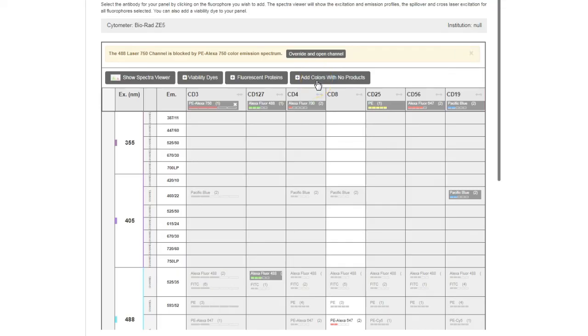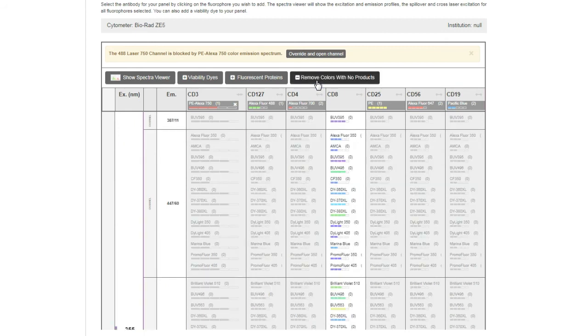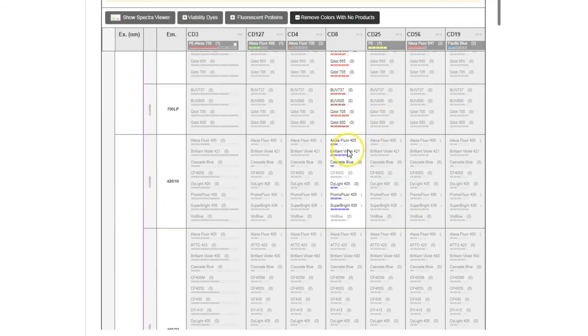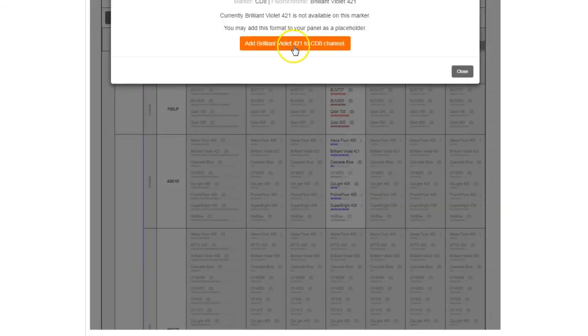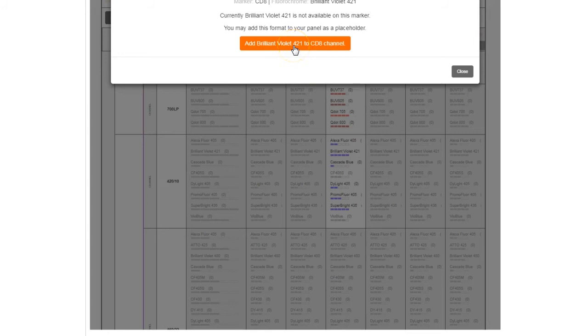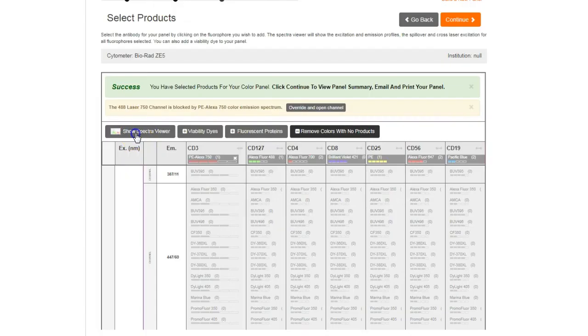If you want to use a fluorophore that is currently unavailable, you can add this format to your panel as a placeholder. This makes it easy to design a panel based on the fluorophores that you may already own and identify any extra fluorophores that you may need. This will save you both time and money.